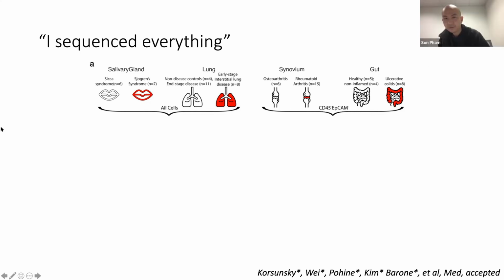Do you have any thoughts on handling tumor microenvironment studies, the true donor batch effect within immune cell type, but the malignant epithelial cells are not accurately cell typed? Yeah, I mean, cancer is weird in that way, right? Because no two cancer cells should be alike across different donors, right? But at the same time, if every tumor was 100% different among patients, there would be no therapies that would translate across patients, right? So yes, they're different cells, but they probably have very similar underlying processes, right?